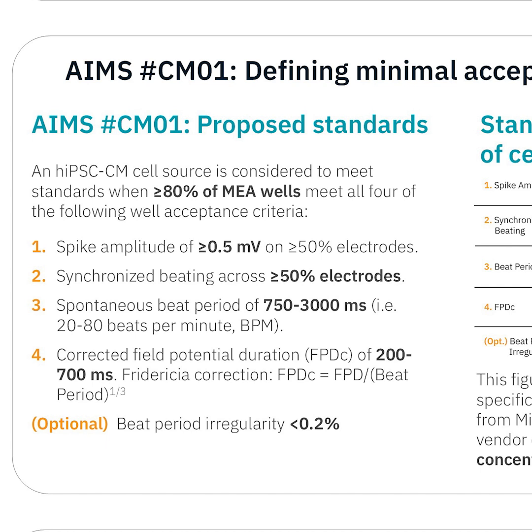this standard. Note, this standard, AIMS CM01, is specifically for iPSC ventricular cardiomyocytes and not iPSC atrial cardiomyocytes. Studies have shown that iPSC atrial cardiomyocytes can often have a spontaneous beat period less than 750 milliseconds. See Thorpe et al. 2023, Figure 2.